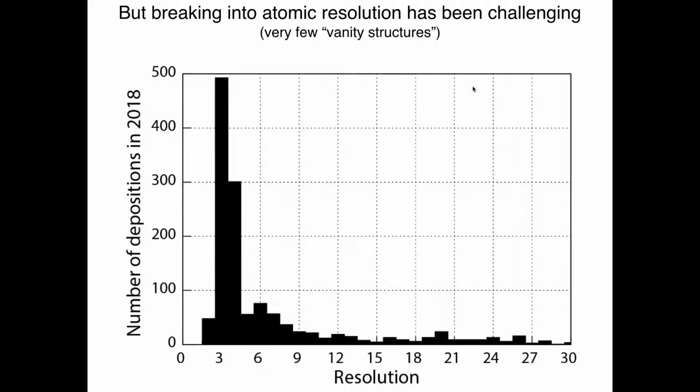Something that we did over the last year is, we were working with a particular specimen, AAV, for technical reasons, and we knew that there weren't any real reconstructions that had been solved to less than 2 angstrom resolution at the time.